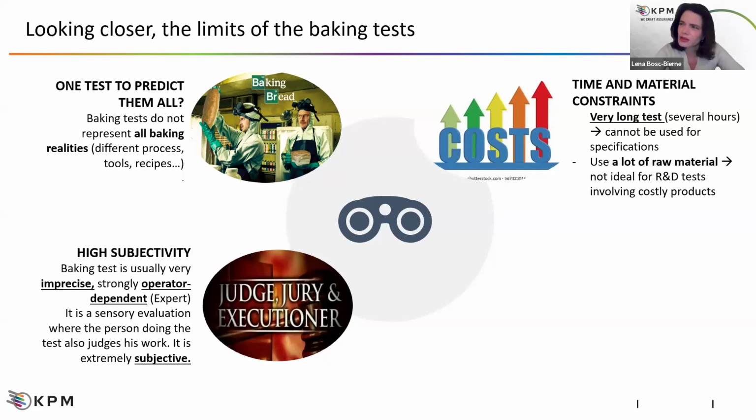We did the test a long time ago, but we sent 3 bags of flours to perform baking test. One bag was flour A, the other bag was flour A plus gluten, and the final bag was flour A plus cysteine. And obviously the baker found that the one with the cysteine was more slack and that the one with gluten needed more water. The trick was, it was the same flour. So the baker baked what he thought he was baking. Not the actual product.